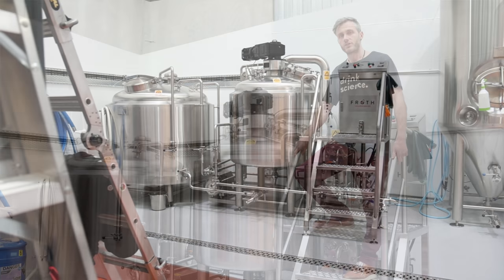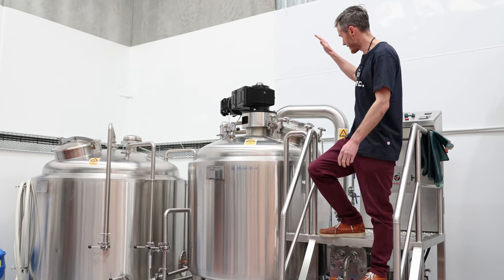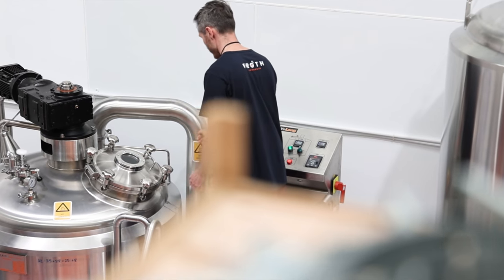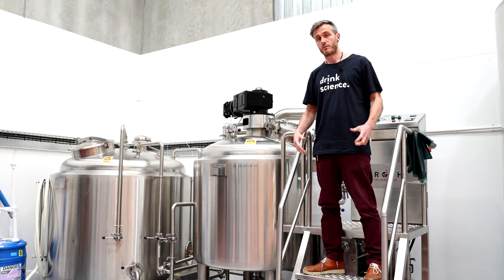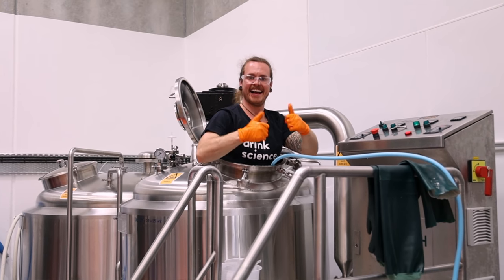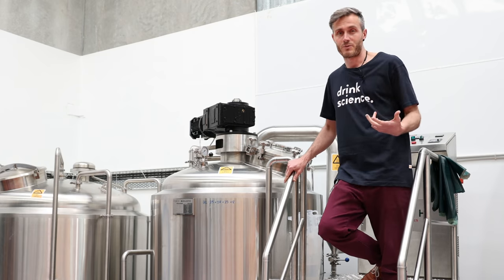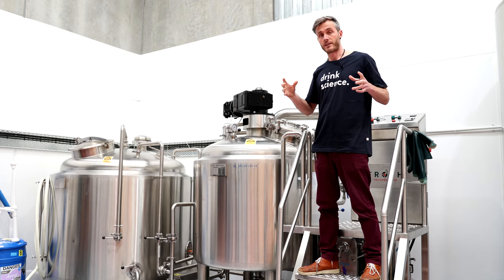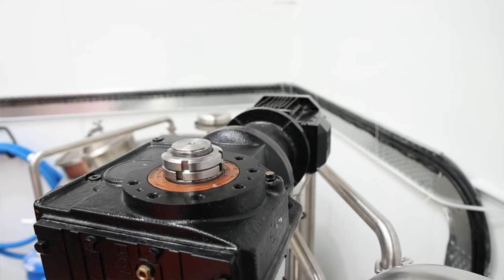This is where the preparation of the media happens — this is where we cook our wort. This right here is our pressure kettle. It's kind of similar to a brewery kettle, but we actually seal off the lid. We heat the wort inside and it comes up to pressure, which raises the boiling temperature to 121 degrees and sterilizes the wort inside. Sanitation is important here because we're growing a microbe — the yeast is growing on wort sugars, which is a really great environment for other spoilage organisms to jump in and cause havoc. We're starting with a clean base, and once we add our pure yeast culture in there, it's only that organism that's growing in the tank. This motor up here is stirring a rake inside so we can mix that malt extract with water.